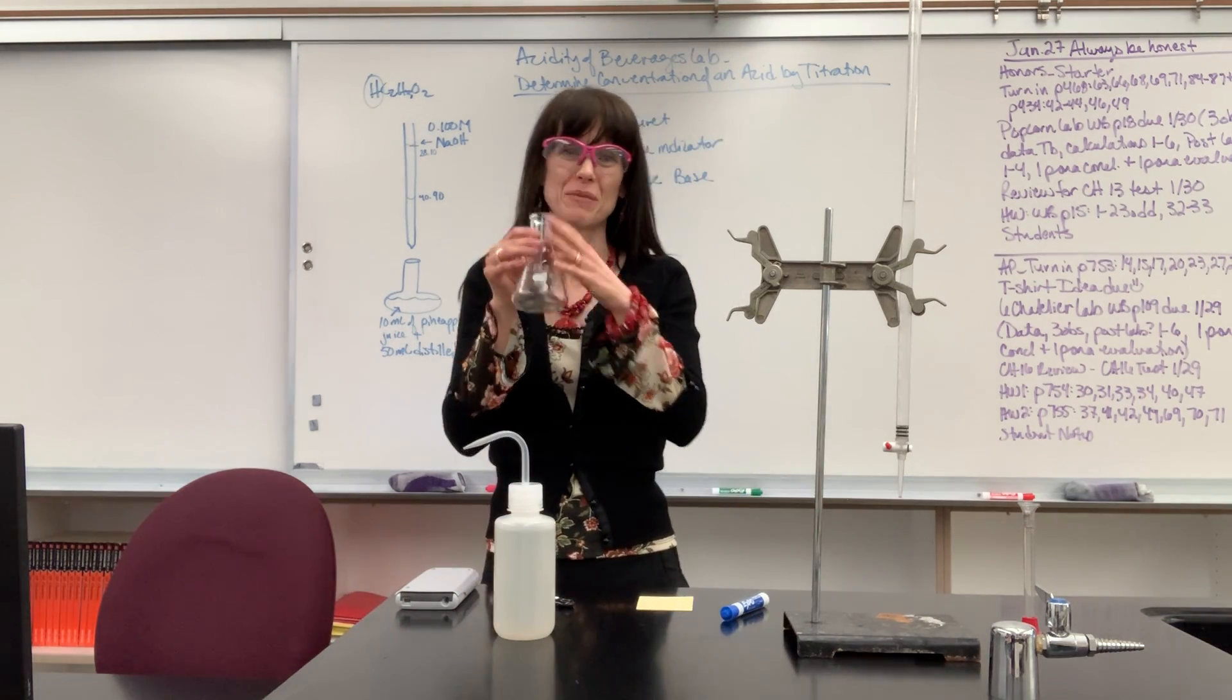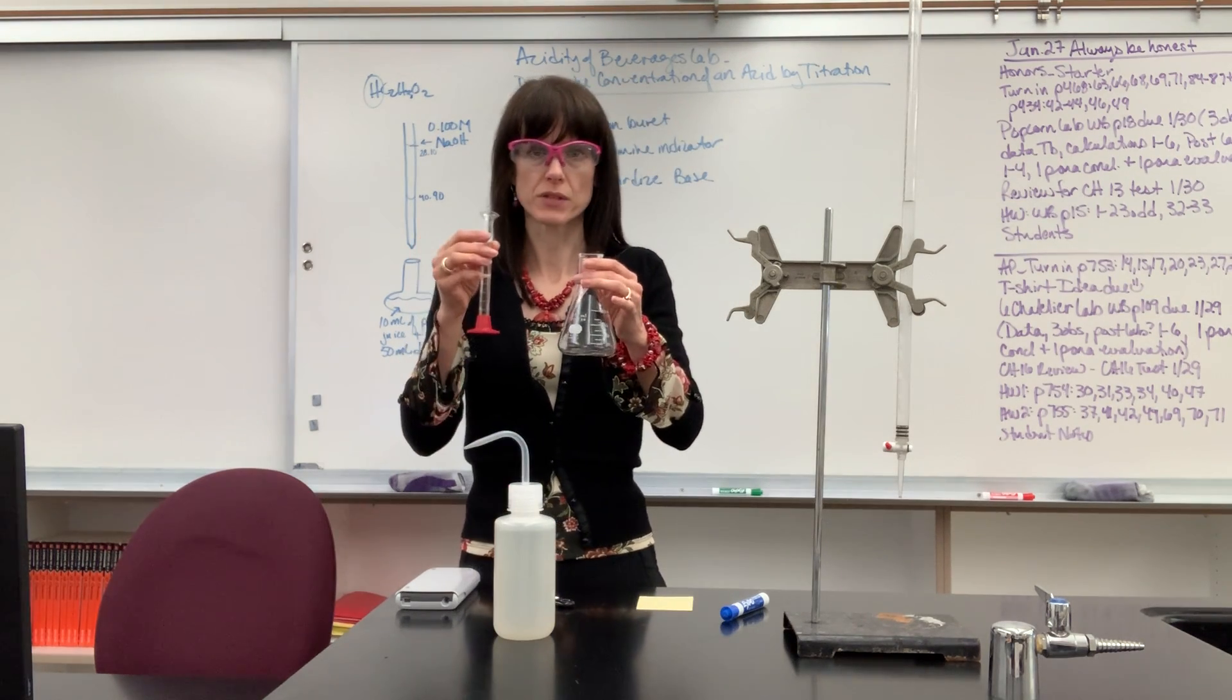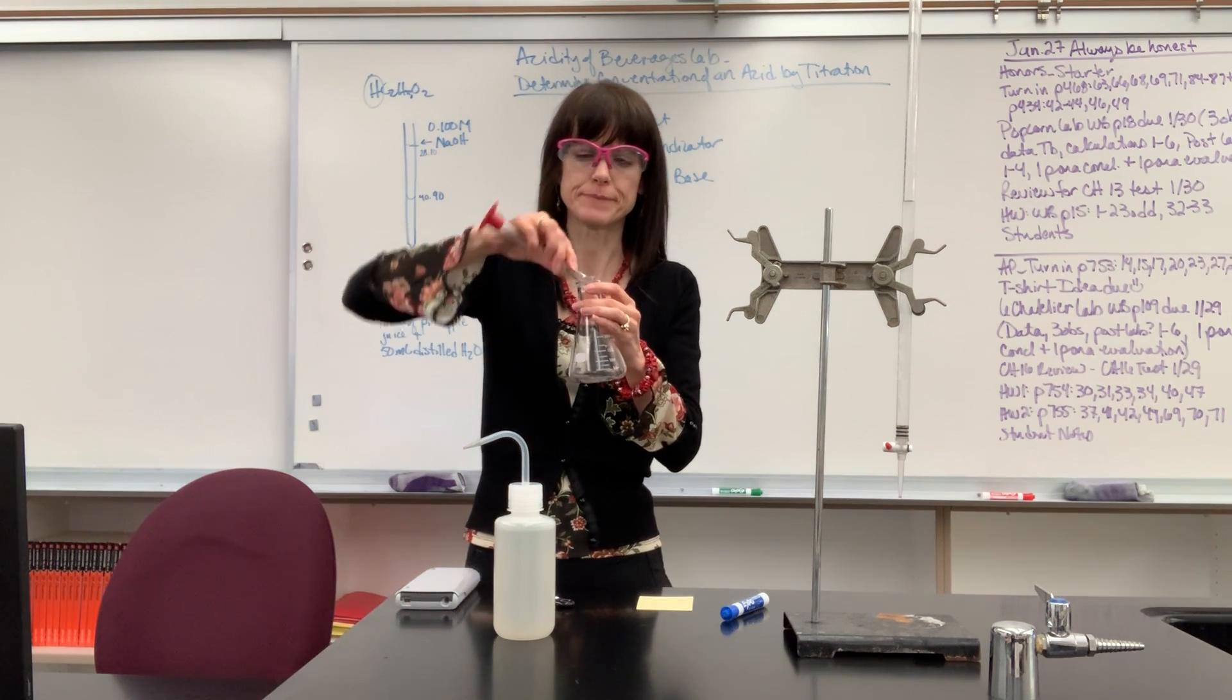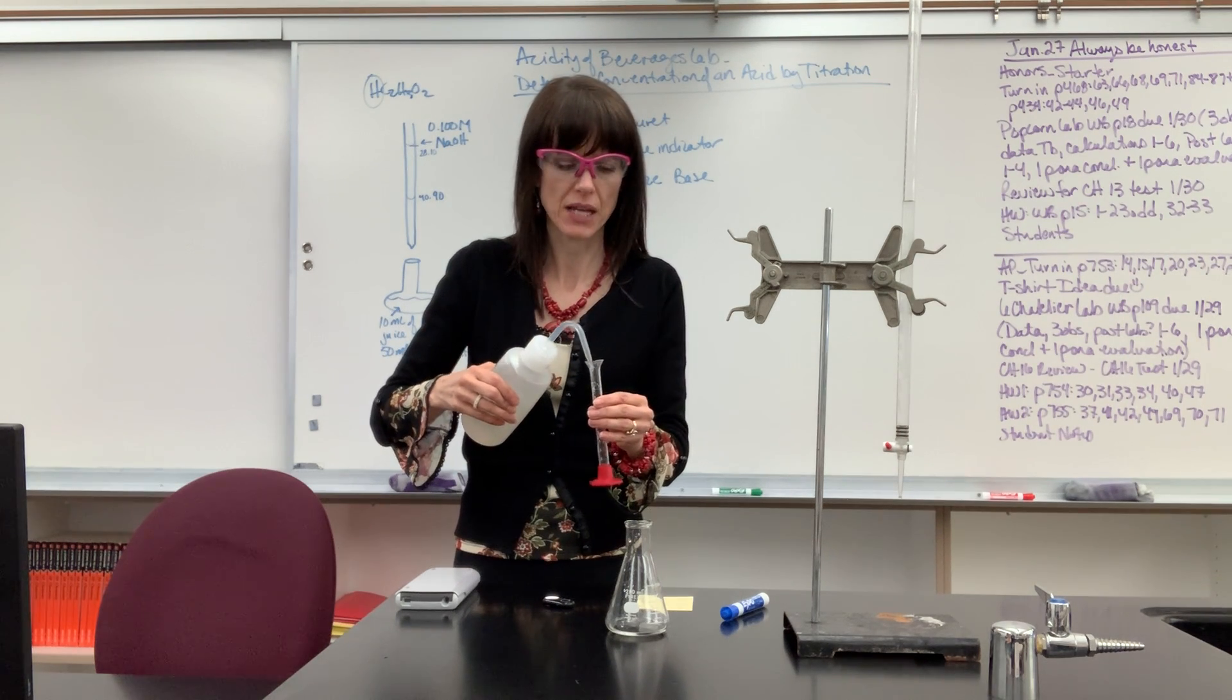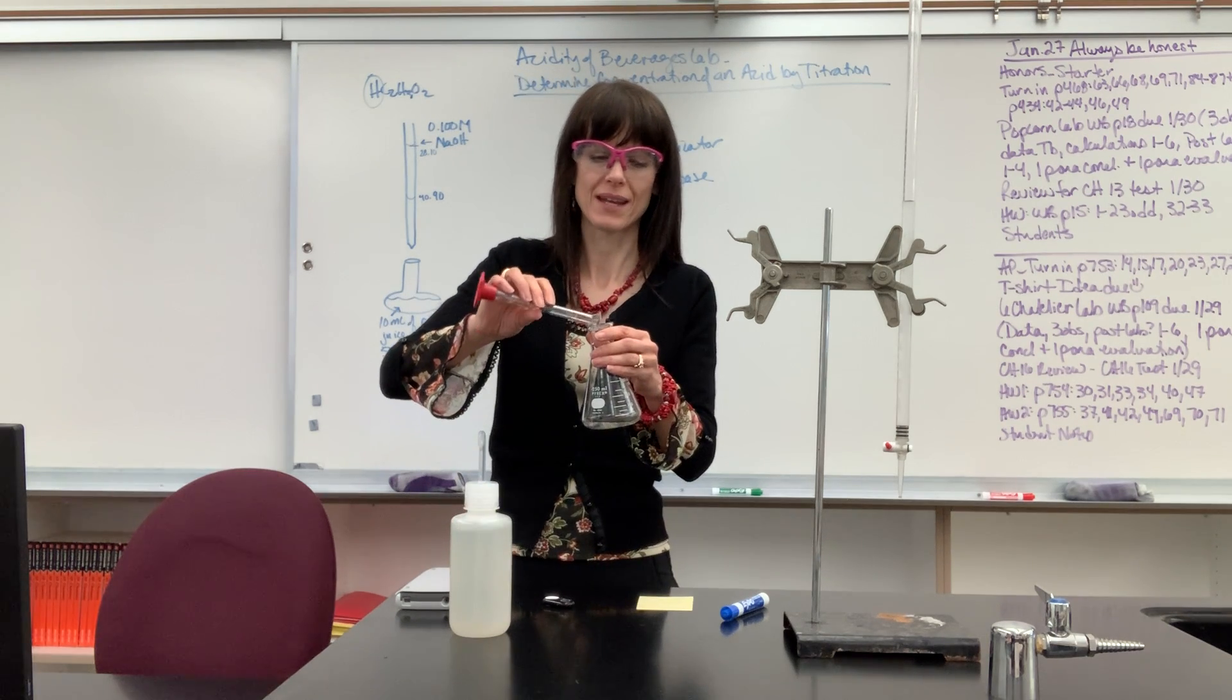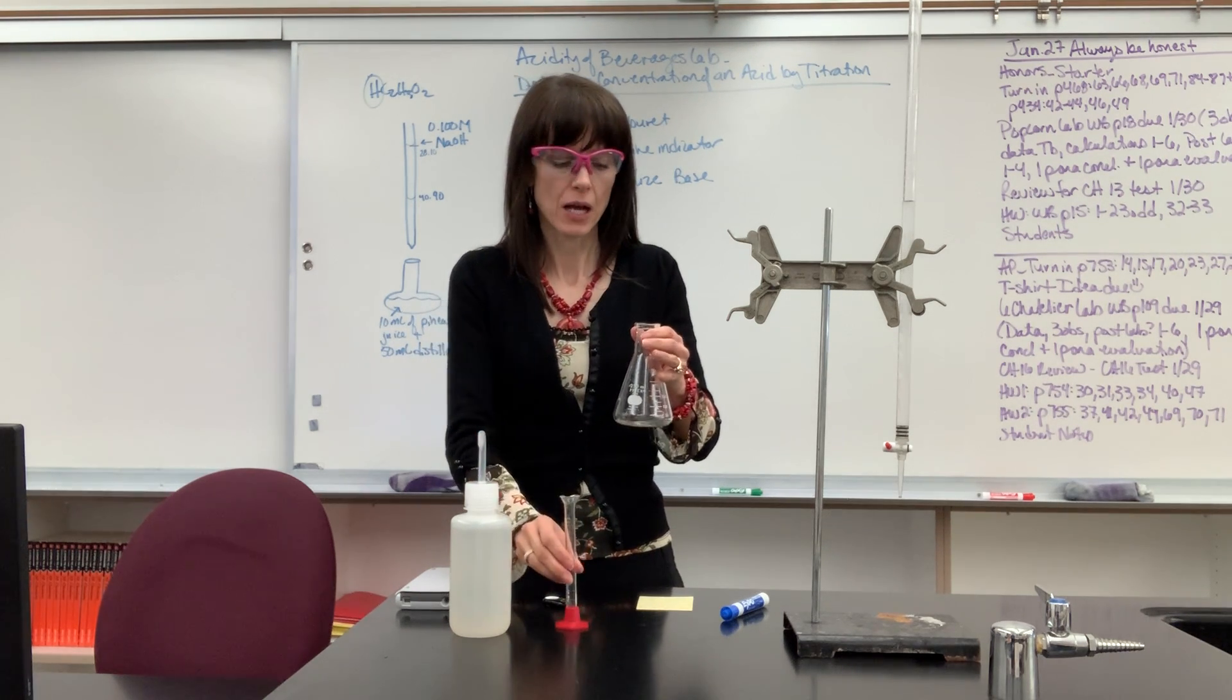Inside the Erlenmeyer flask, I have my students use graduated cylinders. You might be using a graduated pipette. Measure out their 10 mils of the pineapple juice, and they pour this in. I will also have my students wash this, that they're going to, I want to make sure we get all that pineapple juice out. So they'll wash this with distilled water, and then they'll pour that in. Now, some of you might be going, no, wait, wait, wait, Mrs. Love.